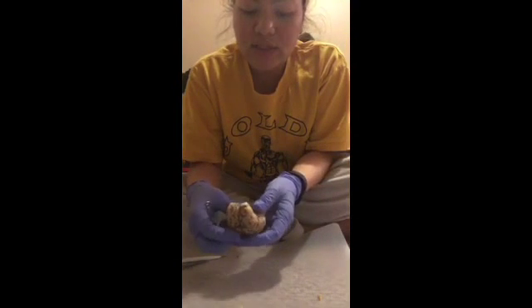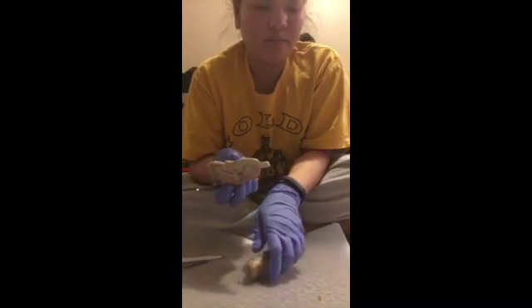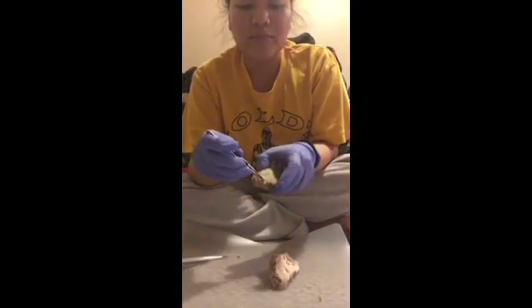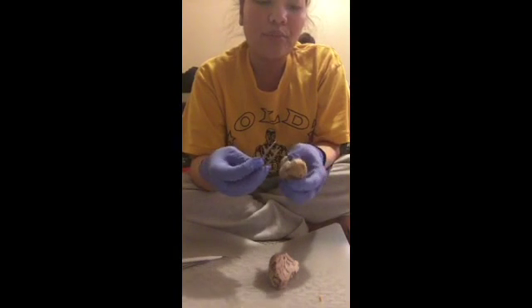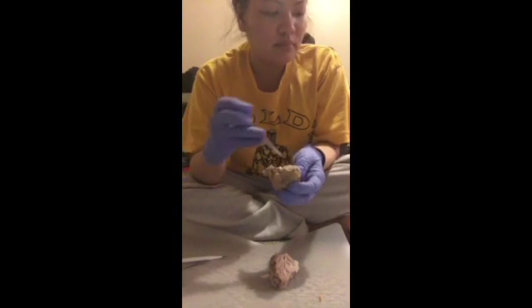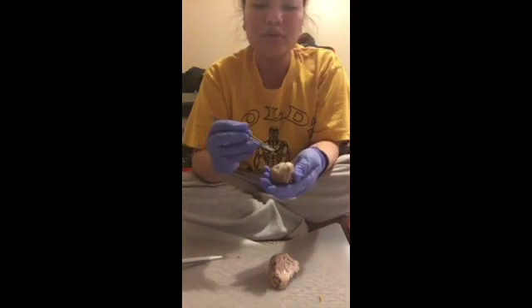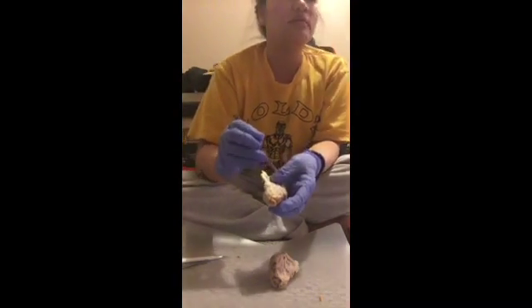So now the sagittal section of the brain. This, as we know, is the cerebrum. The corpus callosum is this one.